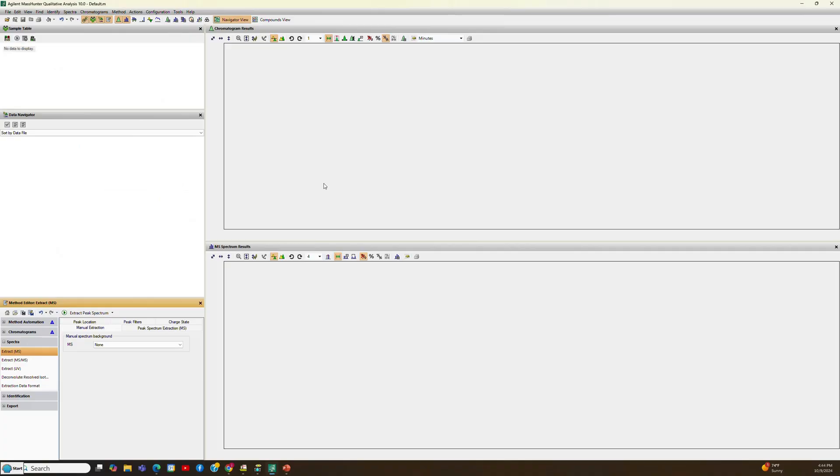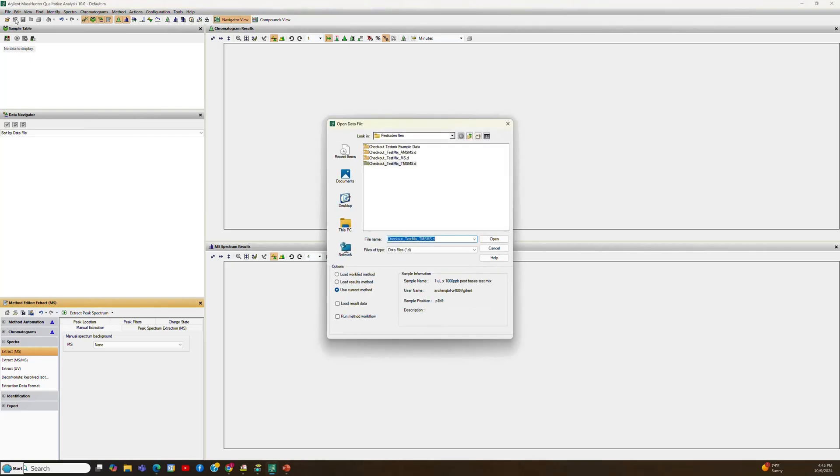The first thing that I will do in the overview video is to open a file to show you how it is processed. So we're going to MassHunter, open a data file, and I'll open this targeted MS-MS file.